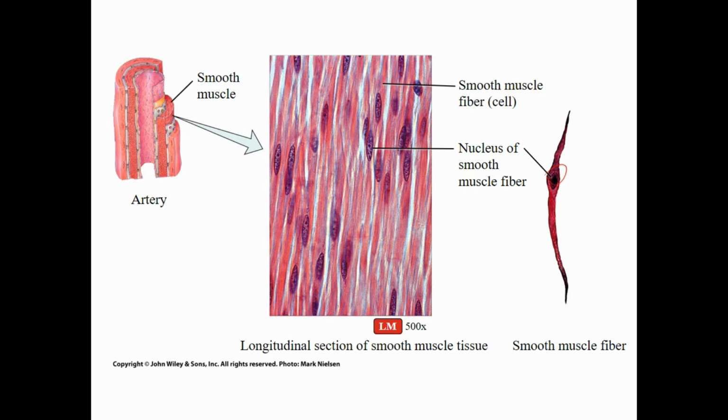So again, if you see this picture, I won't just ask what kind of tissue, I will actually ask what kind of muscle tissue we are looking at. Wow, I don't know why it keeps giving me those lines to shoot out there. So I will help you narrow it down when asking you to ID it.